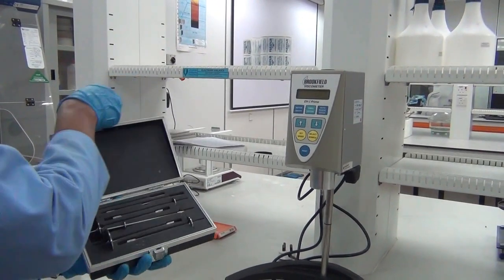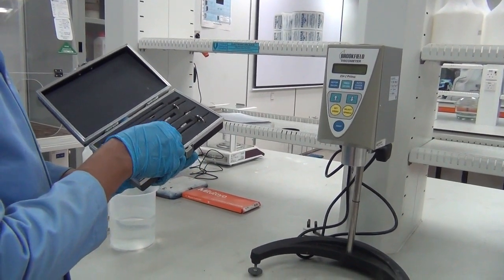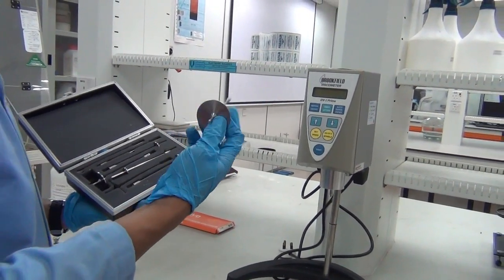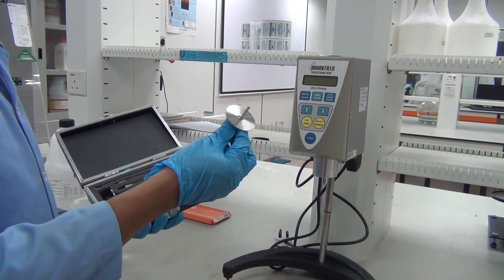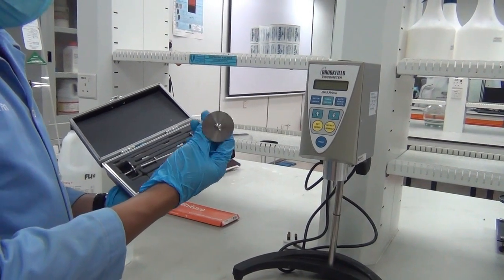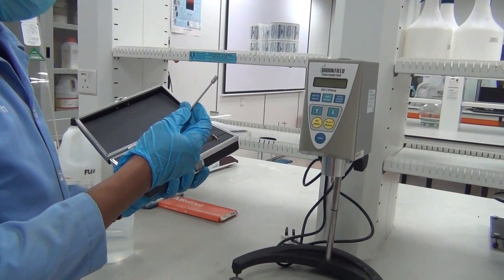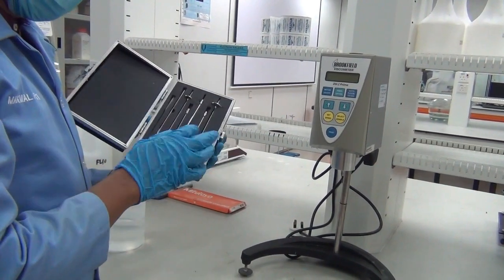There are several types of spindle with different sizes. First we have SO2, which is a big spindle. There is a number for each spindle, starting with SO2 until SO7.